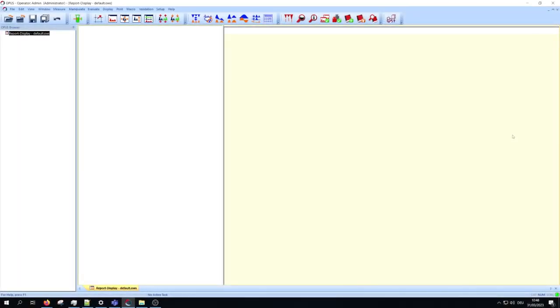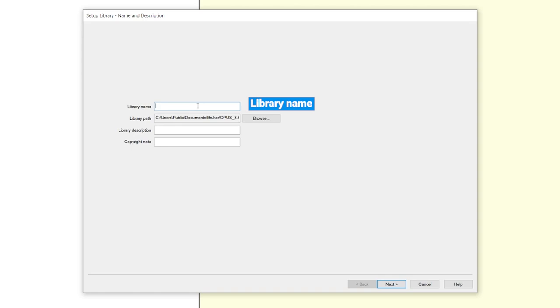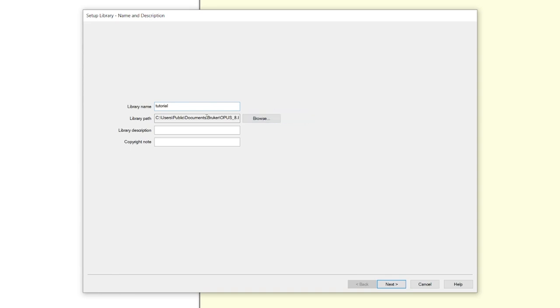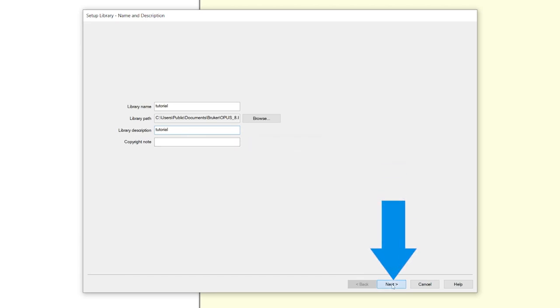Start the creation by clicking on setup library. In the opened window you must enter your library name, your library path (we recommend maintaining the standard path), a short description of the library you want to create, and you can enter a copyright note. Proceed with the next button.